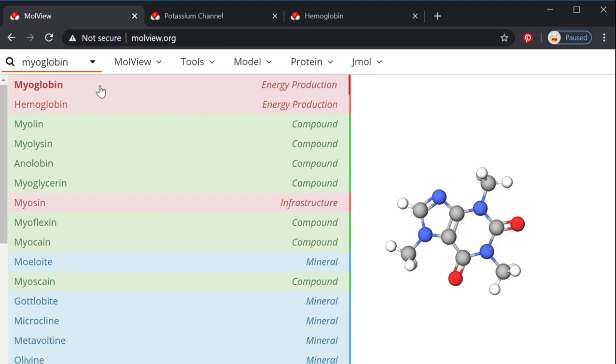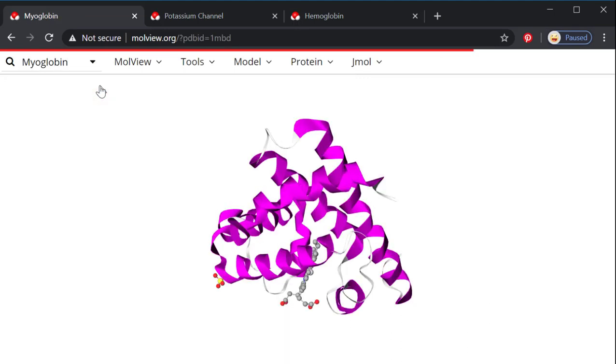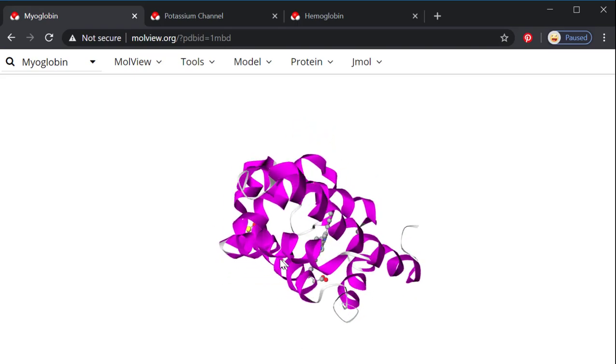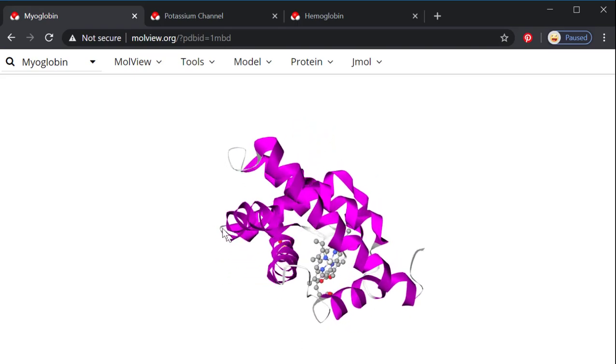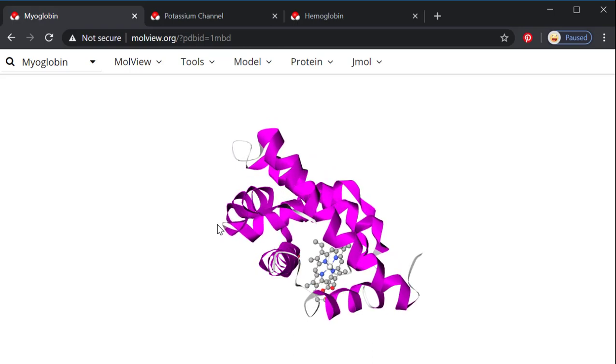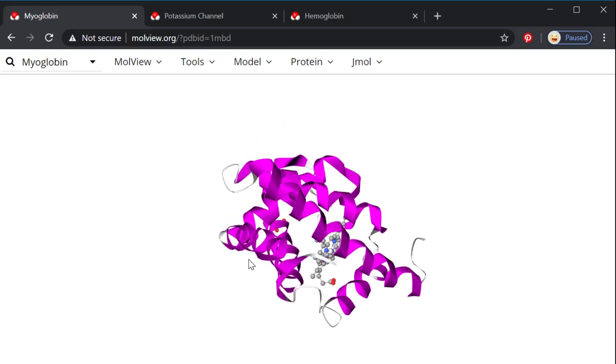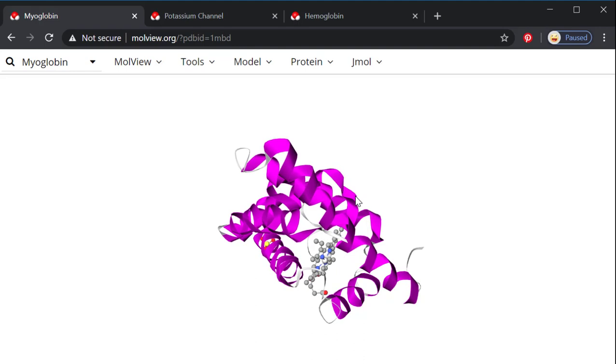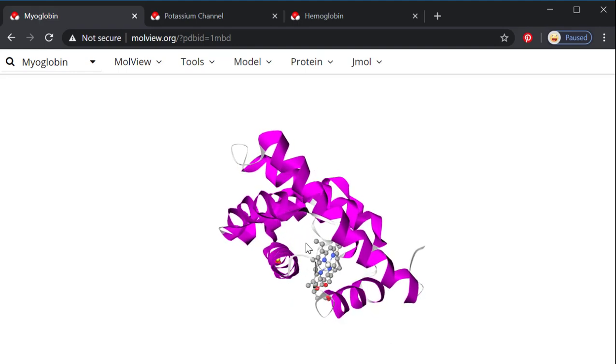So you can see here that I can select it, and it's going to give me the protein structure for it. If you hold down with your mouse, you can spin this around, and you can see that the purple is the protein portion of this myoglobin, and then in the center here, the ball and stick piece, this is a heme with an iron in the middle. This is the non-protein portion of myoglobin.